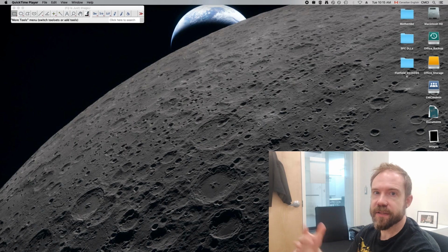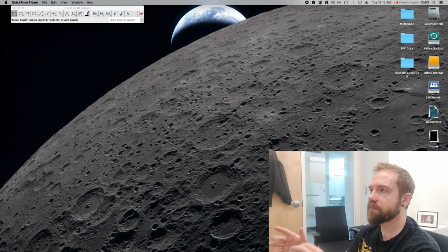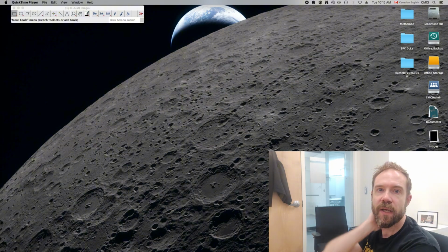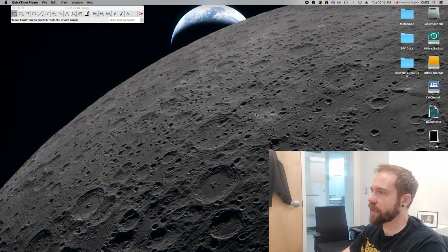So for loops, this is really where the magic happens as far as ImageJ macro programming is concerned. When you have a list of 1,000 files or something like this, you really want to be able to process those automatically. Let's say you have this really sweet analysis protocol, you've spent a long time working on it, you're very confident that it will work for all of your files, but you have to run it on all of the 1,000 files in the folder. You can use a for loop, and then you can go and make a coffee or whatever whilst that runs across your large data set.